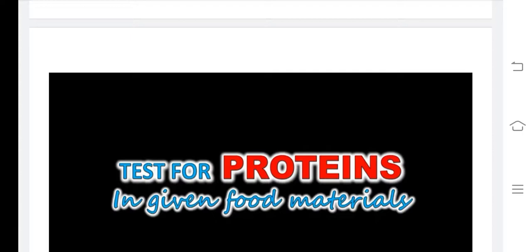Then in order to test protein, we require materials. What are the materials? What are the food items we require? We require egg or milk. Okay, pulses. Then how can we test for proteins in a given material? So now tell me, what are the steps we are going to follow? We are going to follow a three step procedure, right? So what is the aim of the experiment? Test for proteins in a given material.